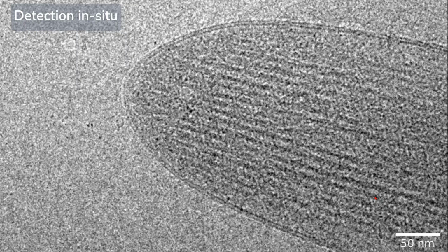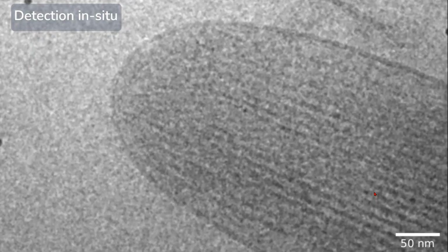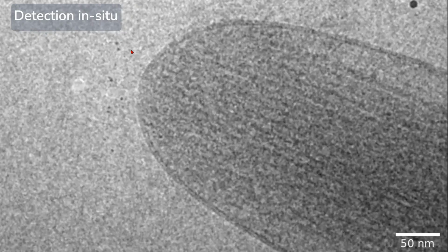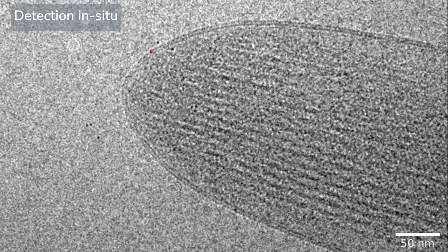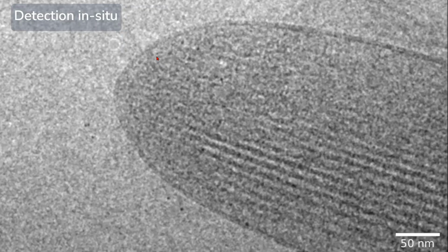And when the first tilt series came in, we were quite ecstatic to see that we could see these black dots kind of travel in pairs together at a reasonable, about 50 nanometer distance from the membrane.